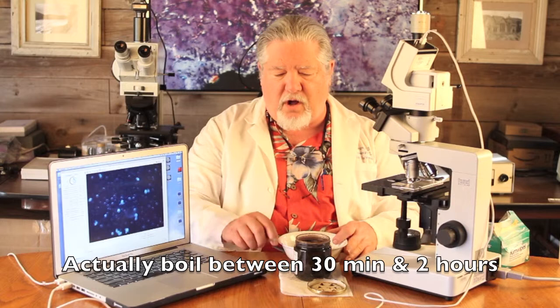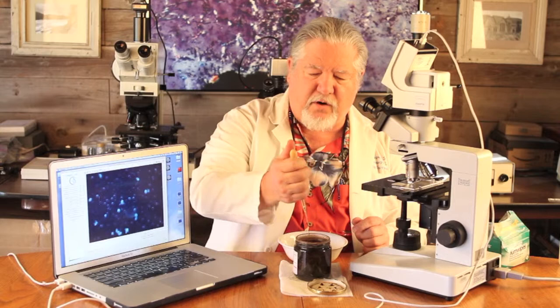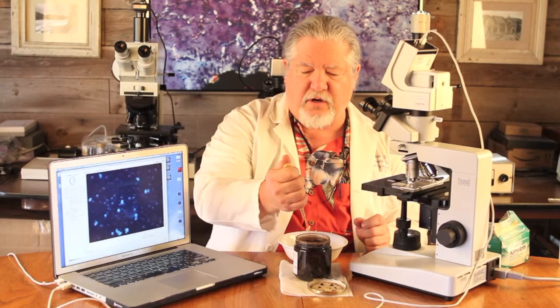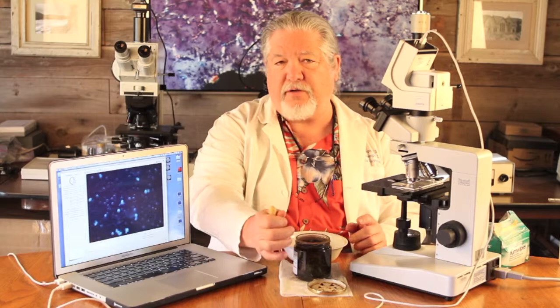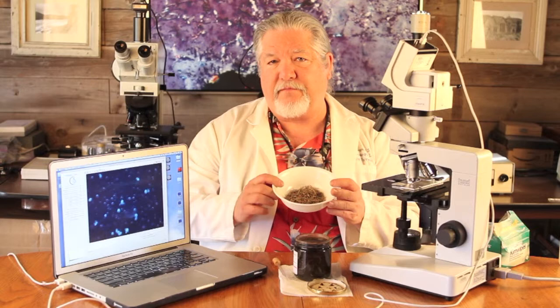So you boil this on the stove for 30 minutes or an hour, then you put it all in a container — I have a glass jar here — and after a week or so, you'll start to see some microorganisms growing in these fluids. You can make slides out of this. Refer back to episode one on how to make slides and use glass slides and cover slips. And you can get a good collection of all kinds of different microbes from this hay infusion.